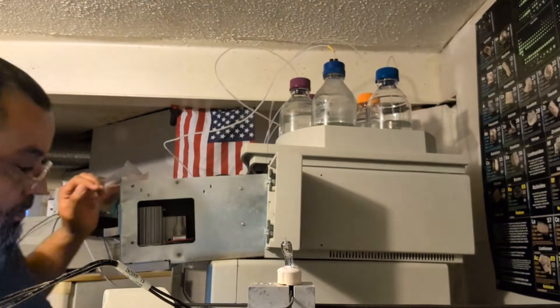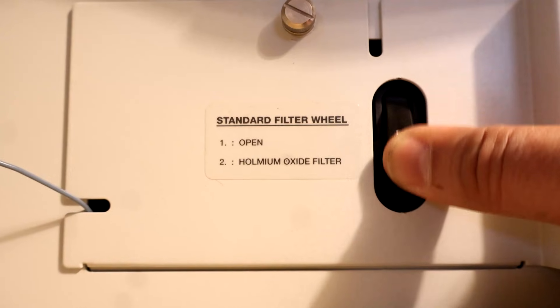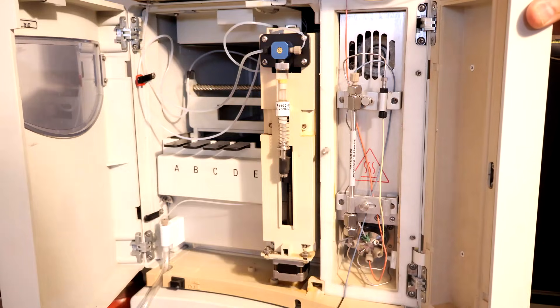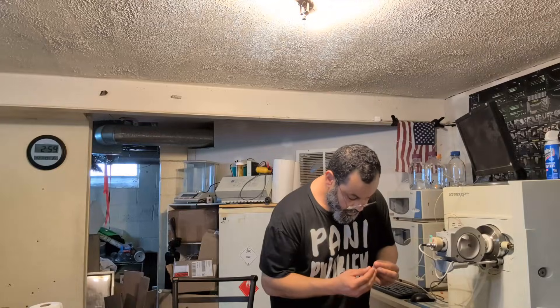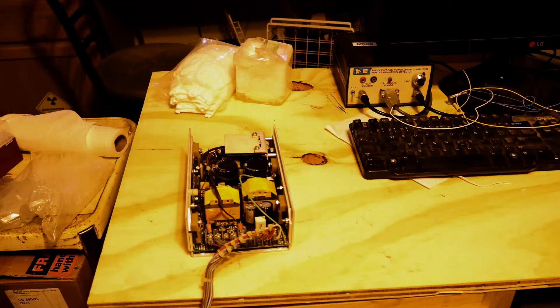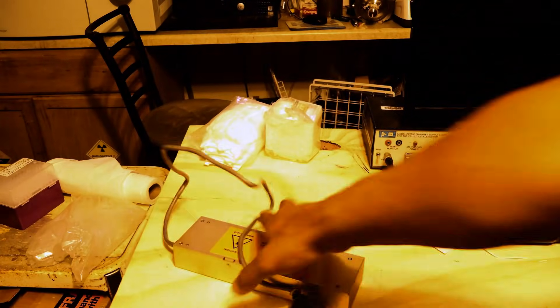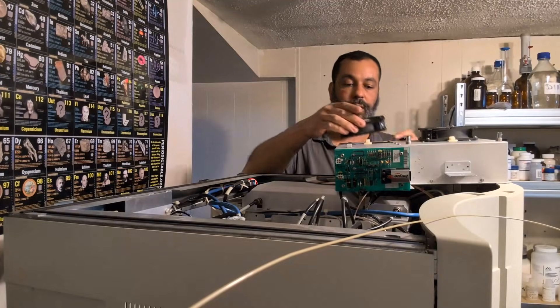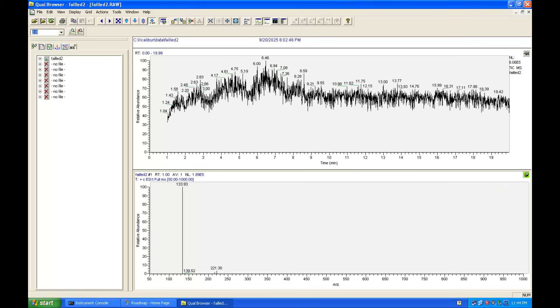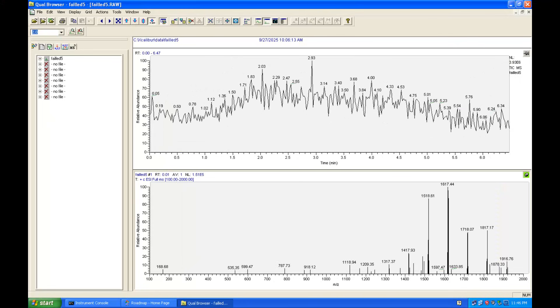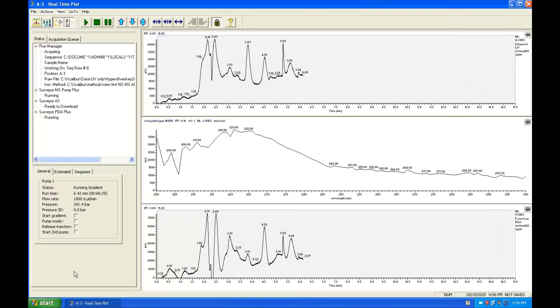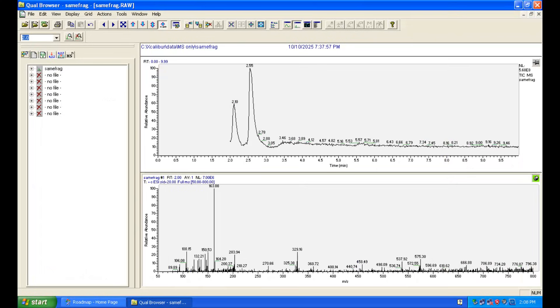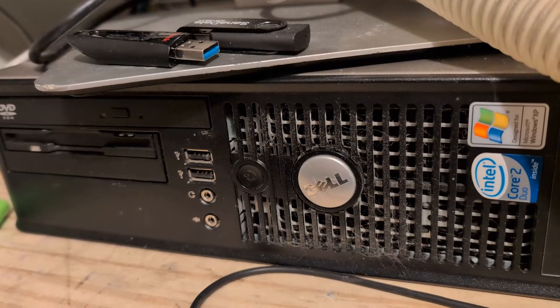The PDA needed a set of new light bulbs. The calibration worked great using the inner holmium oxide filter wheel. I replaced the column in the autosampler, the solvent tray was missing, the pump had to be thoroughly flushed and one channel was clogged. I also replaced both low and high voltage power supplies in the MS. One of the turbopump cooling fans was broken. Once all this was fixed and after many failures to determine the correct flow rate, solvent ratio, pressure, voltage, method development was tedious and time-consuming. And when I finally started to get some decent results, the computer died.